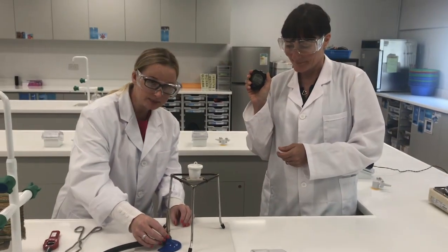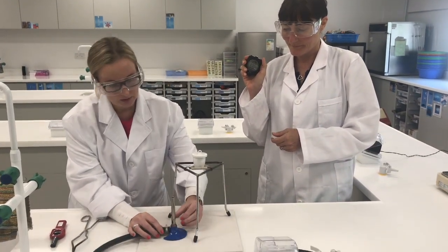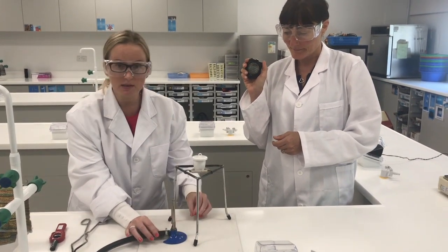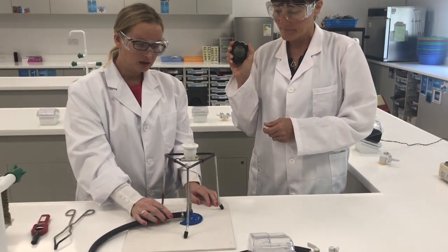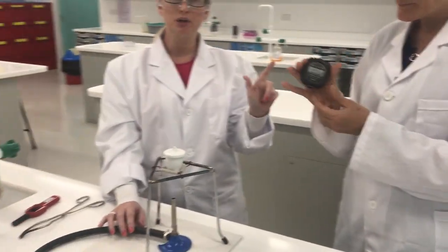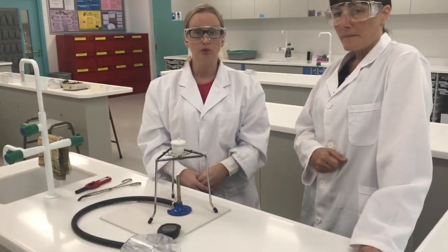This experiment must be conducted with the blue hottest flame — the roaring flame — so open the air hole fully. Once the air hole has been opened fully, insert the Bunsen burner underneath the crucible and start your stopwatch. Time the reaction and allow it to proceed for 3 minutes.